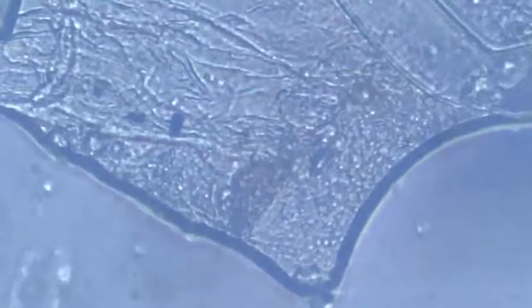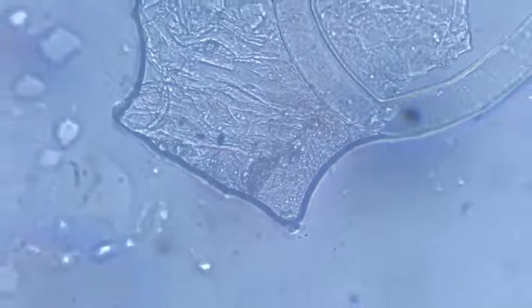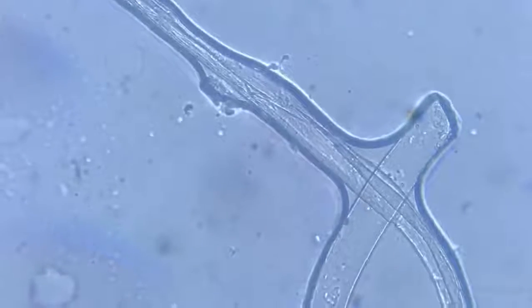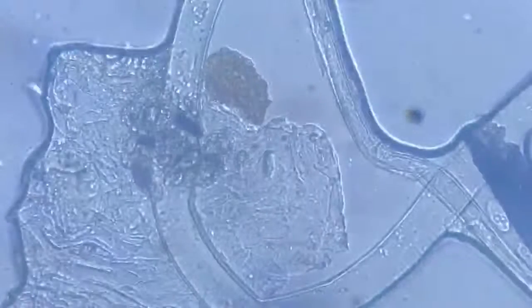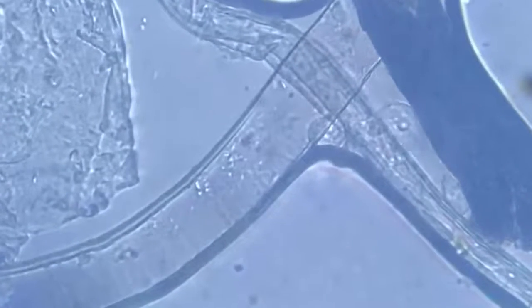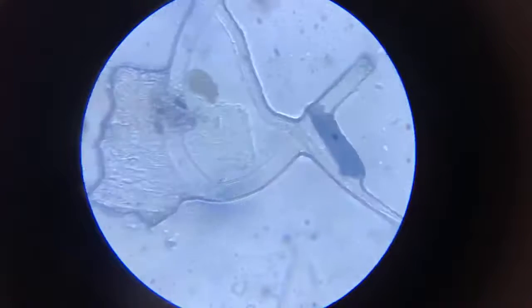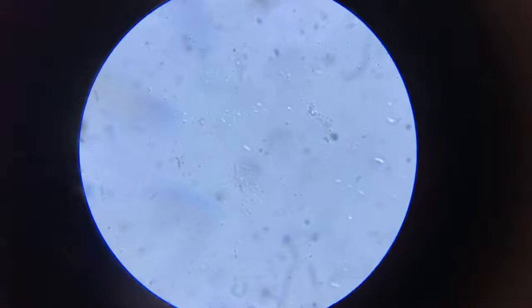There you see. Okay, so now go to the other ones who are still surviving. There were a few, but they all must have been trapped by now. Because the water film has reduced so significantly, there is hardly any organism left except for this Euglena here, trying to give it a fight. The water film is all covered up.